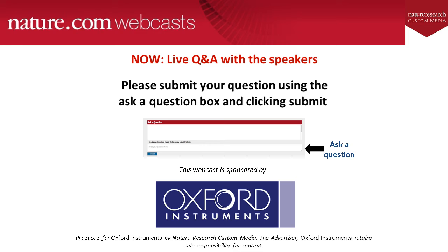Excellent. Thanks, Erin. And our next question is also for you. This one asks, why would you use EDS on stained and embedded samples? Aren't these elements removed during the fixation process? So yeah, this follows on a bit from what I was saying just then.